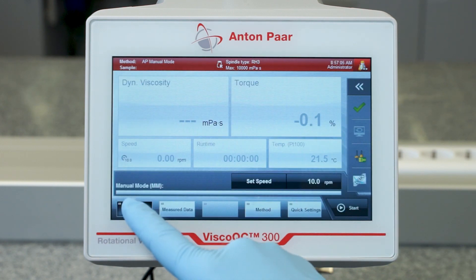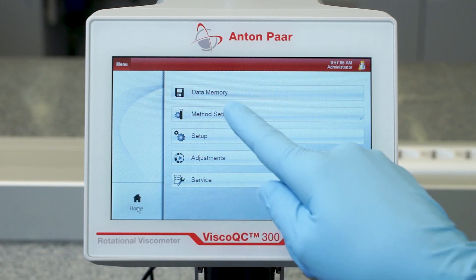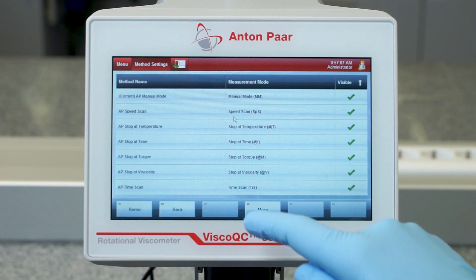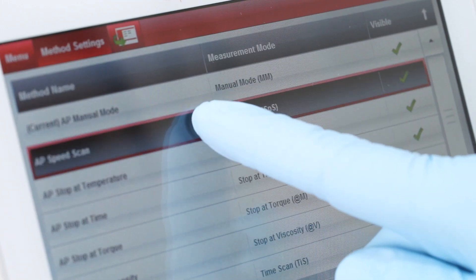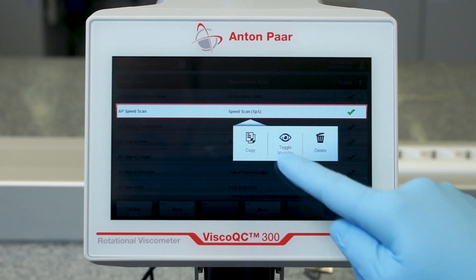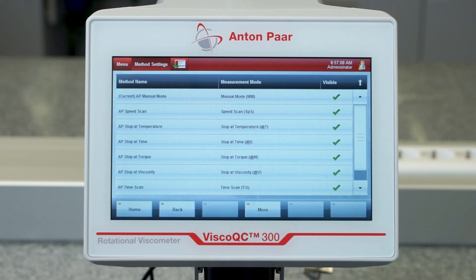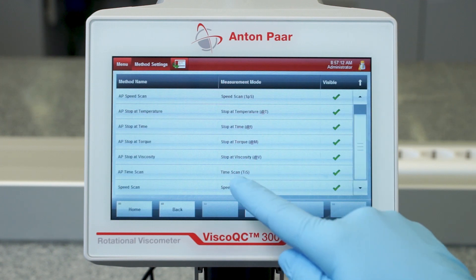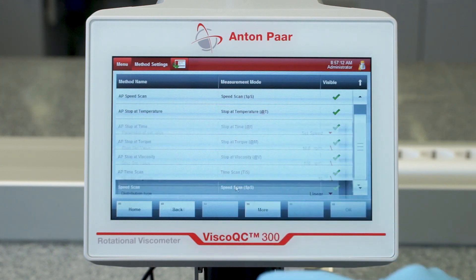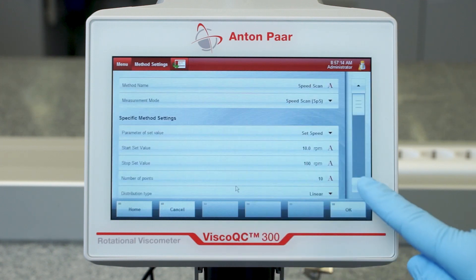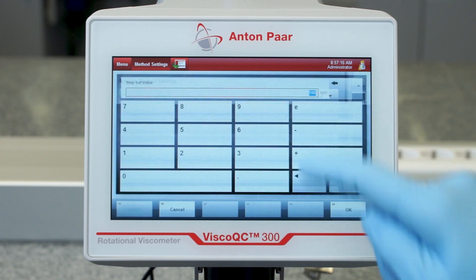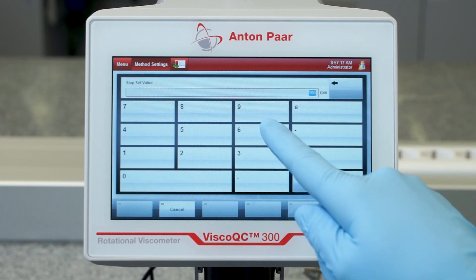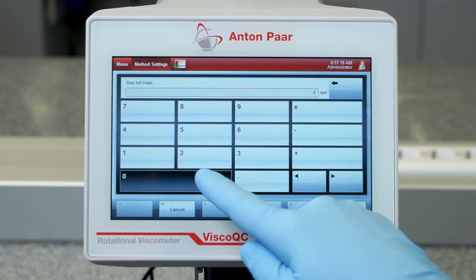You can easily customize your own method by copying a default method such as the AP speed scan. With the speed scan you can study a sample's flow behavior and find out if it is shear thinning, for example like shower gel.